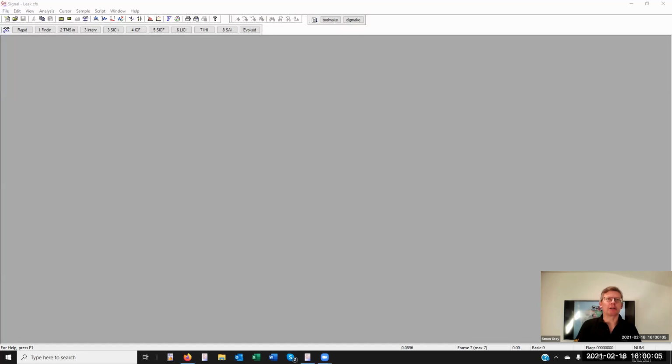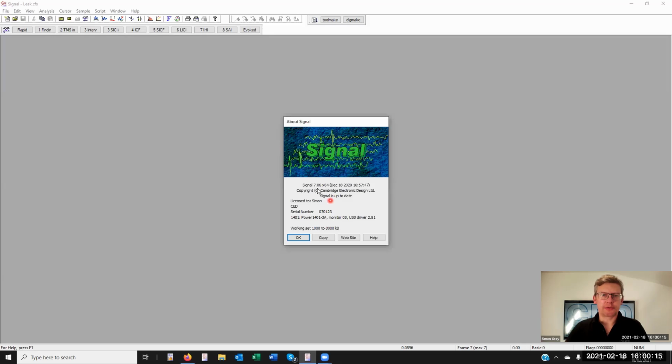Okay, so let's start. This is Signal analysis one, and here we go. I'm using, in this case, Signal version 706. This is the 64-bit version, but there will be no difference between this and the 32-bit for what we're going to do today.